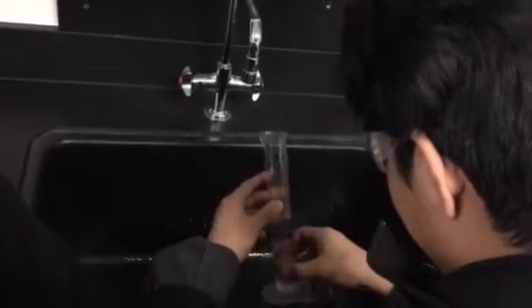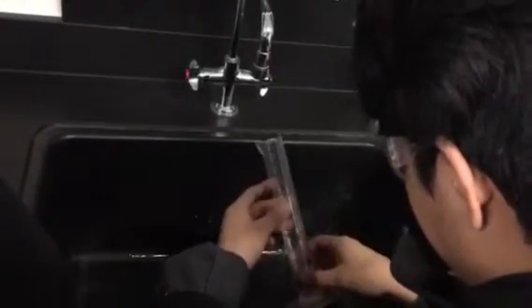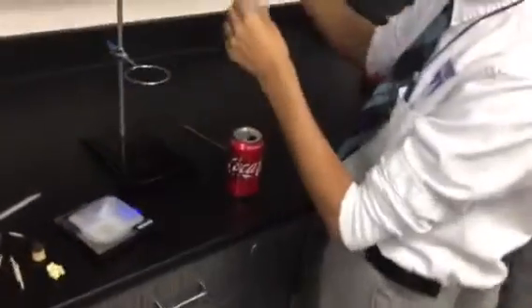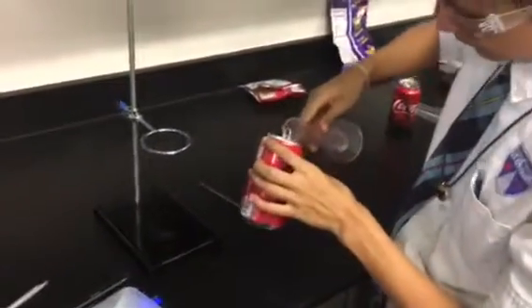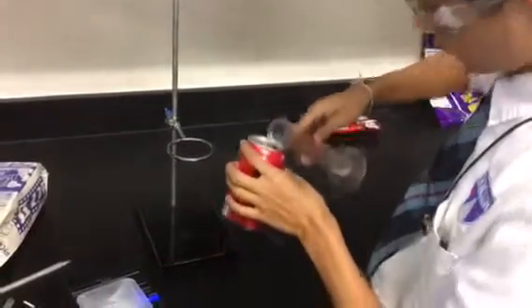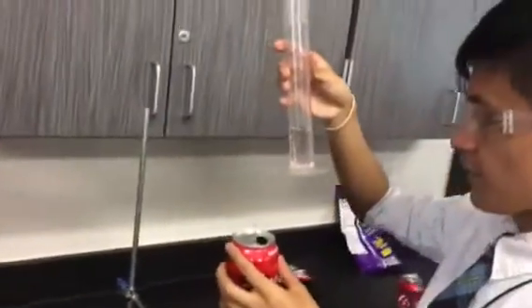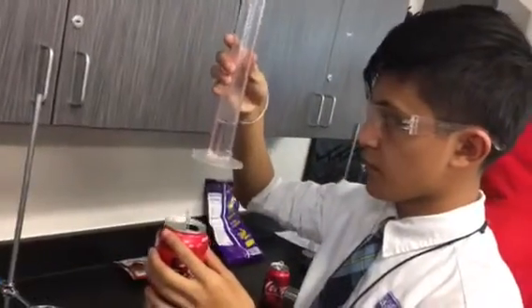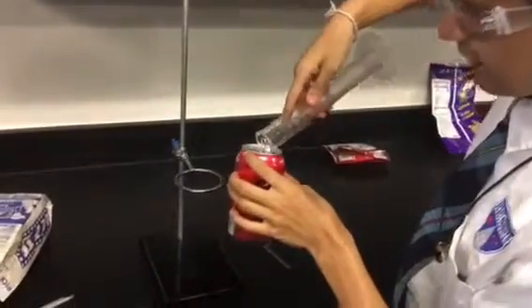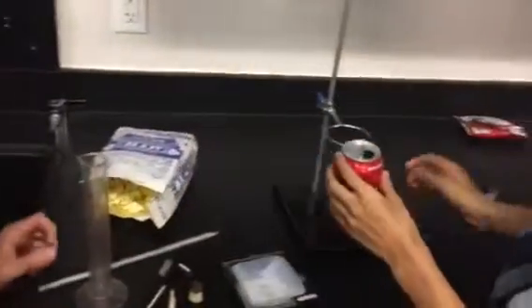You only have 5 minutes left. We're gonna throw this 0.1 away, evaporated water, because we only have like 5 minutes. Now we have to clean the bottom of our can too. Yeah. I would say there's 55. Oh yeah, we still have the water. You have 5 more minutes. All right, we got it. Okay, now we do the same thing.